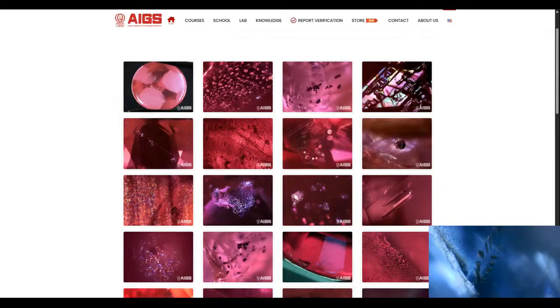I'll talk about digital now. It's about being able to share, being mobile. You need a digital microscope. If you have a question about an inclusion and you want to send it to an expert, take the photo, send it to him, and he will give you an answer. And that's the collective of being a gem expert. You have people around you that might know more than you if you don't have an answer.